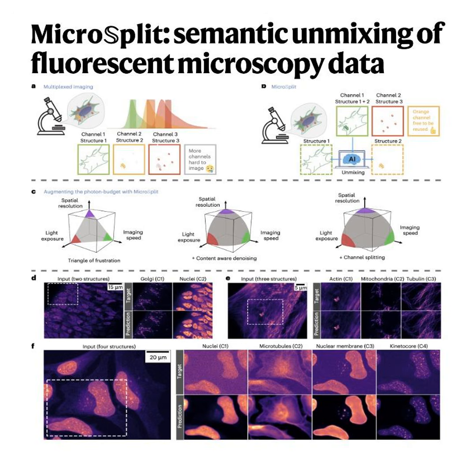Okay, final recap of the day. Bullet 1: MicroSplit struggles with extreme intensity skew, identical structures, and measuring precise pixel intensity. Bullet 2: it outperforms Picasso by requiring only one input image and excelling in high noise environments. So given these limitations, how would you design an experiment to ensure your cellular structures have enough visual contrast for the AI to work? It requires some forethought, for sure.